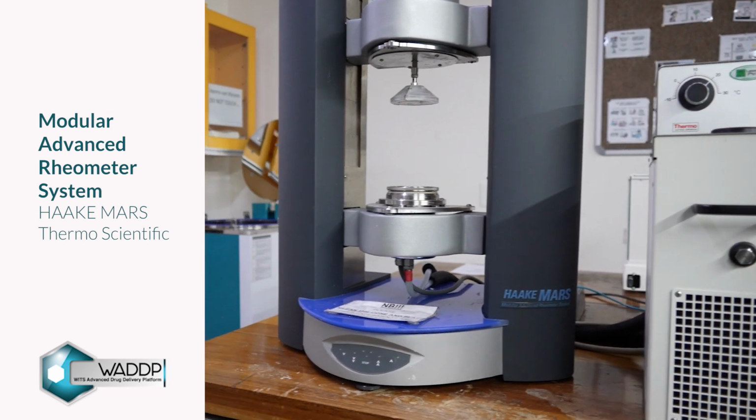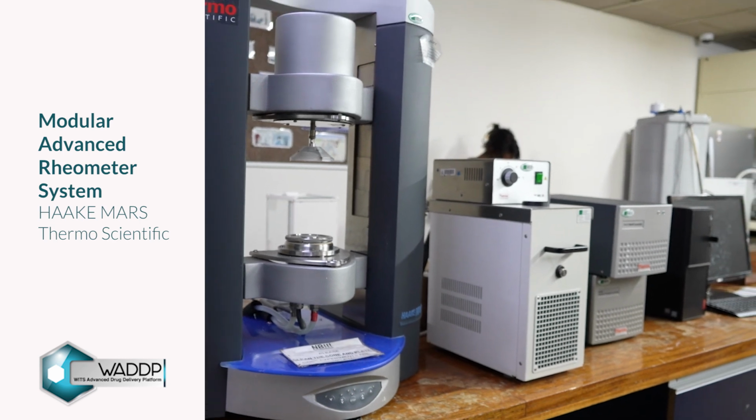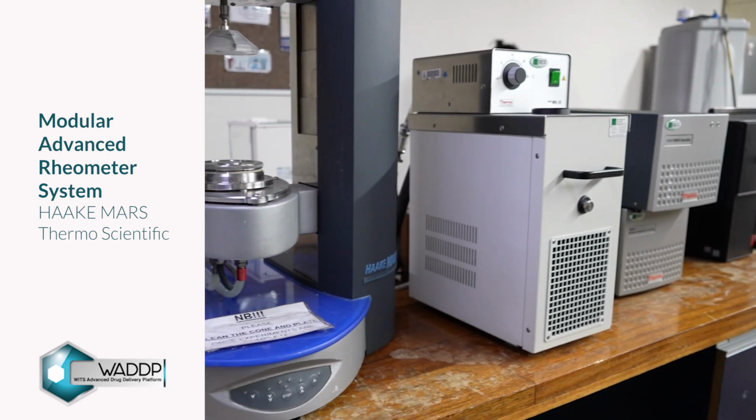Modular Advanced Rheometer System is used to measure the flow and deformation behavior of materials such as complex fluids, semi-solids, pastes, gels, polymer melts, and suspensions.